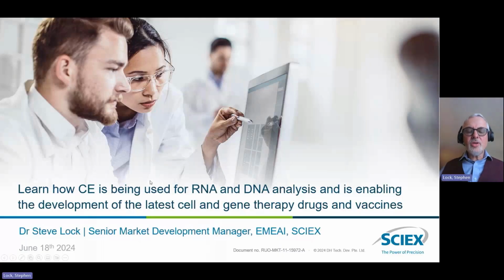So this talk today is to discuss and cover how CE can be used for RNA and DNA analysis, and how this is enabling the development of the latest cell and gene therapy drugs and vaccines. This has really been springboarded in development since the COVID outbreak, as CE has been used quite extensively to help the quality control of vaccines and also in the research of LNP and viral vector type delivery systems for the next generation of drugs.